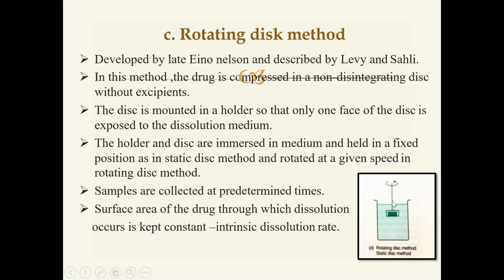The drug is mounted on the plexiglass holder. So this is the drug and this is the plexiglass holder. Like the previous aluminium strip one, here also only a single surface of the disc is exposed to the dissolution medium.